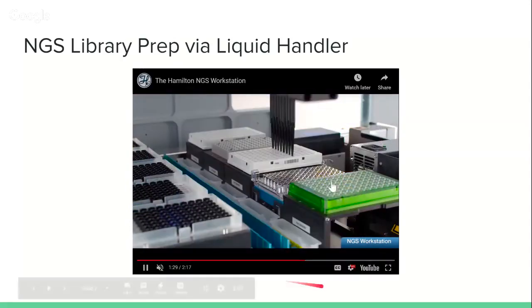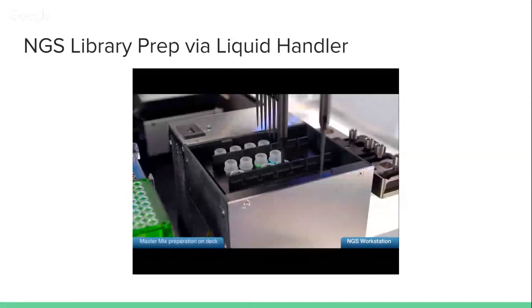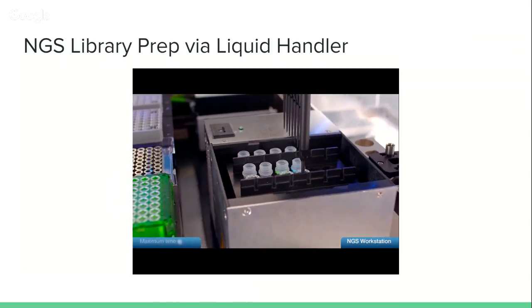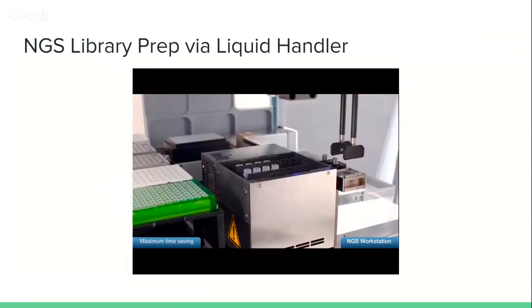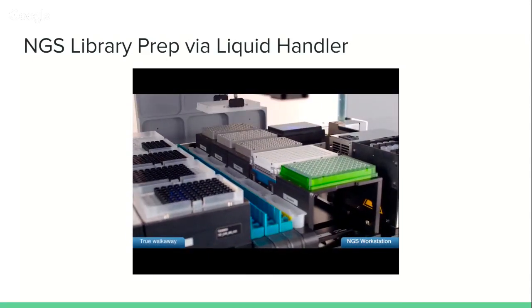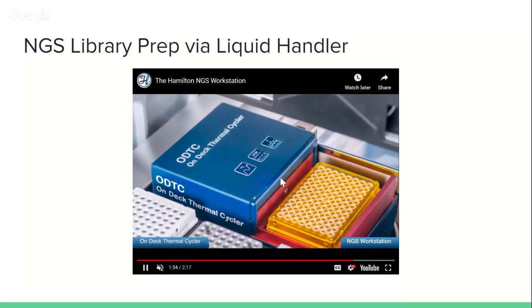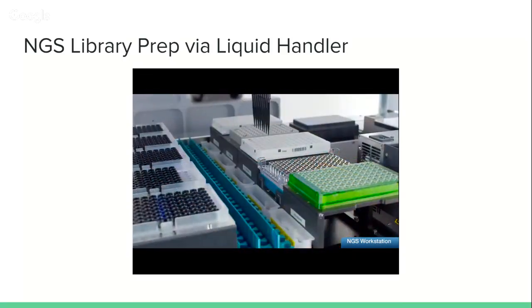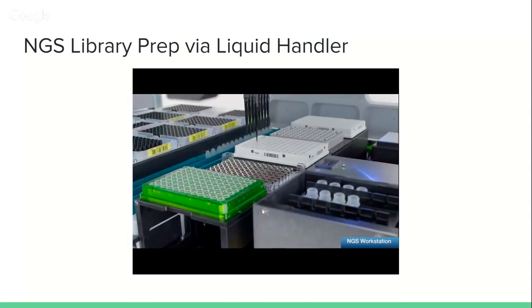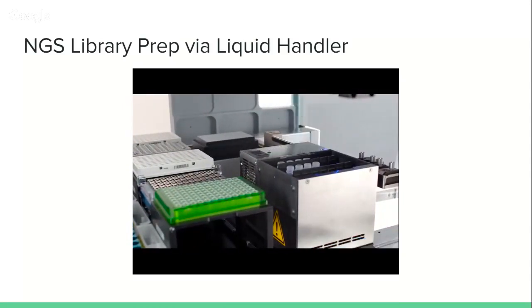And another important consideration, which you saw in the paper, is that they can integrate the quantification of the DNA, meaning once you've library prepped the DNA, you can quantify how much you have of it in each of the 96 samples. And so you can do the pooling at the end to have equi-represented samples in your pool for sequencing. Most of these steps, if not all of them, will be on barcoded materials, tubes and racks and plates, so that the machine can automatically barcode everything. And same for the reagents, so that you can keep track of which reagent lots you've used.